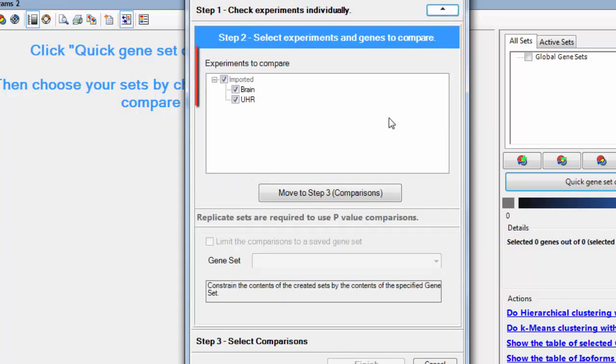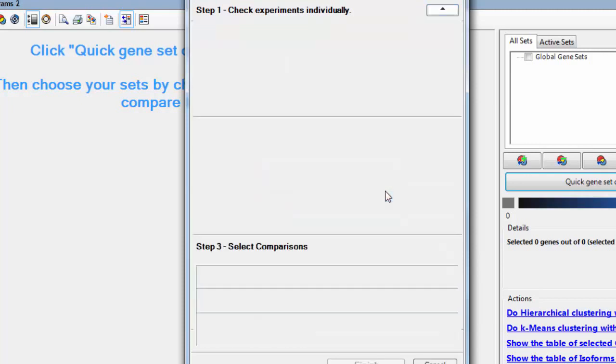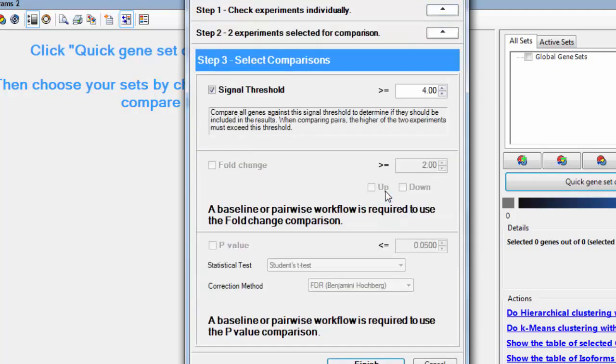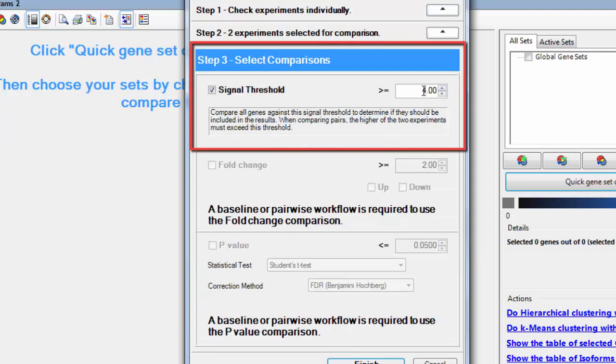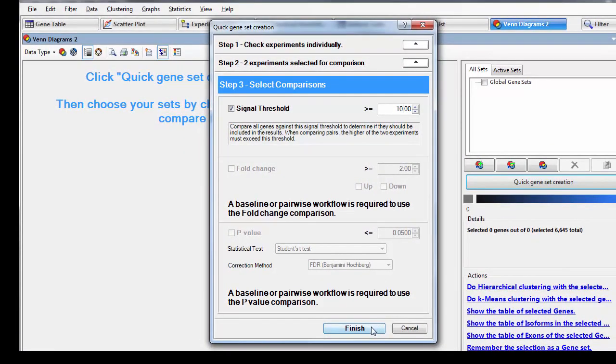Step two asks me to select my experiments, and both of mine are already selected. And in step three, I can specify that I want to find genes with a signal threshold greater than or equal to 10. I'll click finish.